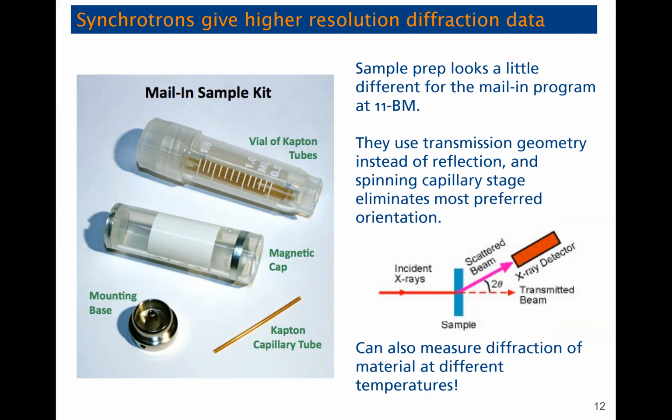With the flat stage, we're limited. Our powders are suspended there, we can't flip it upside down or anything like that. You're limited to 180 degrees around. Whereas here, the X-ray detector can be everywhere that the incident beam is not. So you get almost 360 if you want.